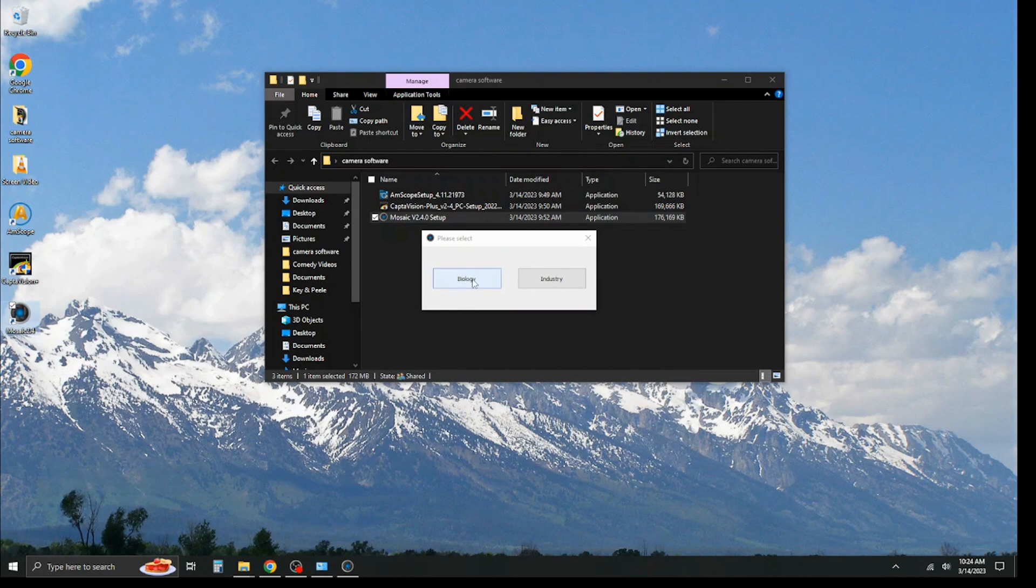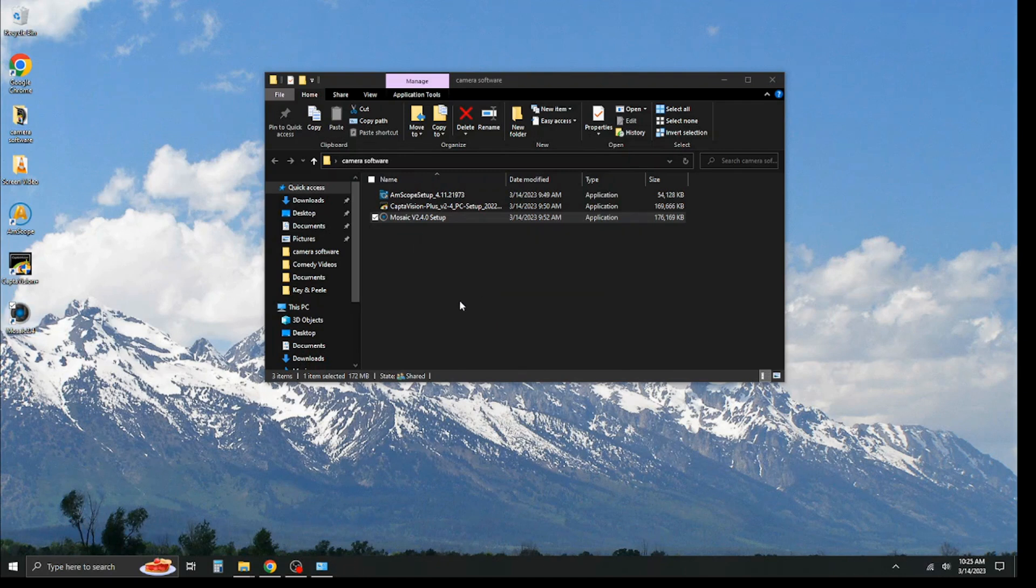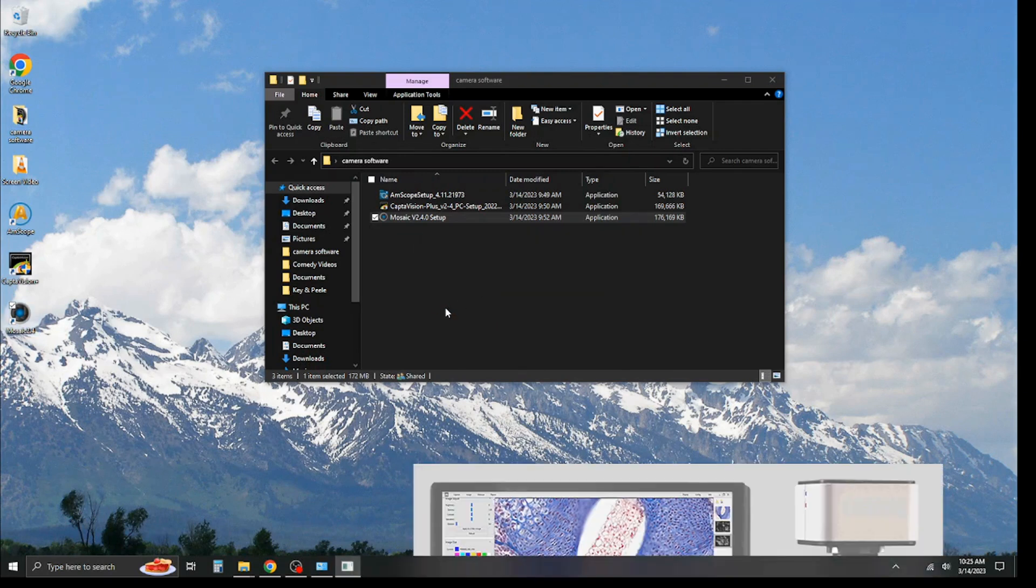And then, again, you'll notice we're also given a biology and industry selection here. We're going to click biology again because that's just our most common use. And you see it's popping up down here in the corner.